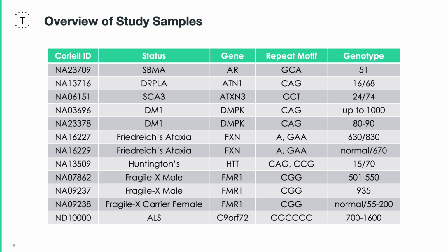The table here highlights a subset of the samples analyzed, giving an overview of the target loci and allele sizes we characterized as part of this evaluation.